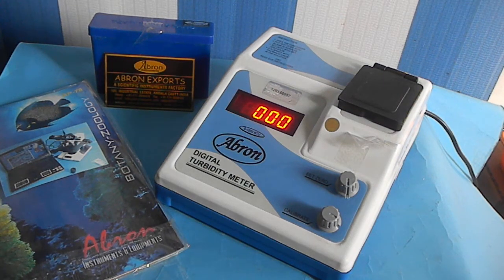This is the turbidity apparatus. To check the turbidity of any chemical, we have this excellent digital instrument called a turbidity meter.